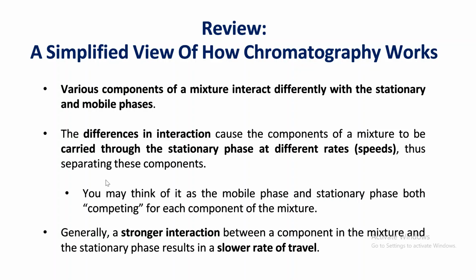Now, the differences in these interactions, as we say, cause the components of a mixture to be carried through the stationary phase at different speeds. Very important, and this is the reason that we are able to separate these components. You may think of it as the mobile phase and stationary phase competing for each component of the mixture.